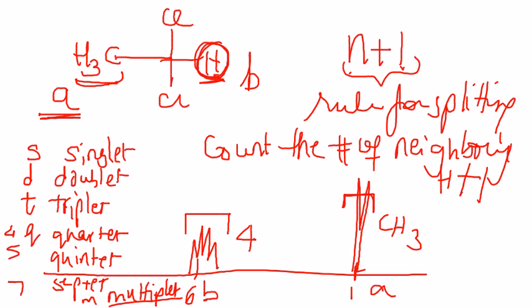Okay. And depending on the separation of these peaks, one can actually make a call. That separation is called the coupling constant, or J coupling. You don't have to worry about that as much. Grad school, you'll learn more, or if you are a chem major, junior year or senior year, you would learn more about that then. But right now, just realize that nuclei that have the same chemical shift or the exact same chemical environment are not going to exhibit spin-spin splitting.